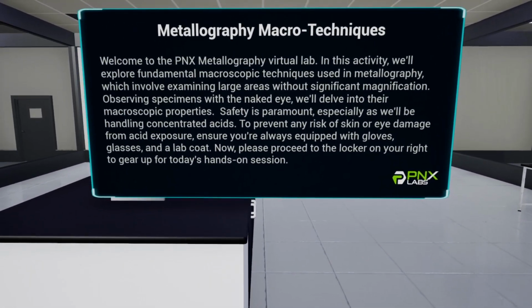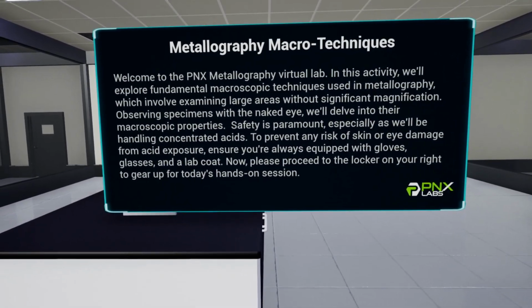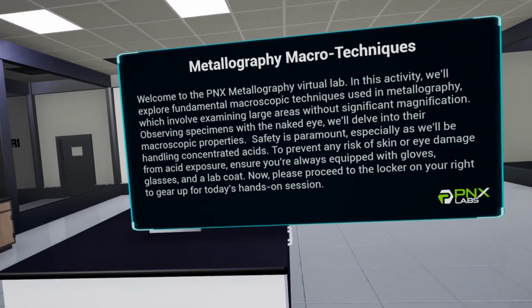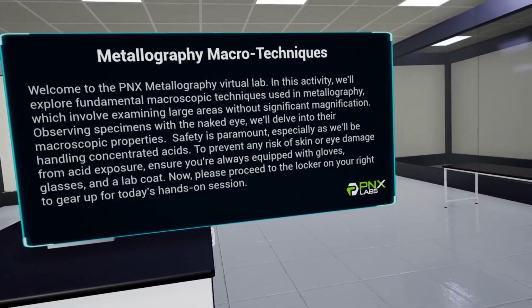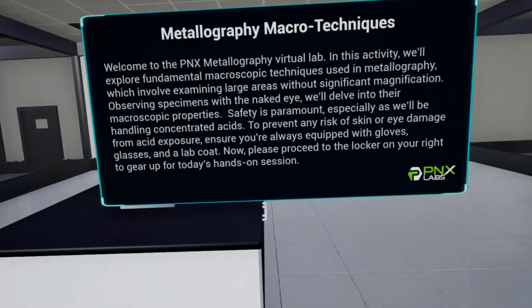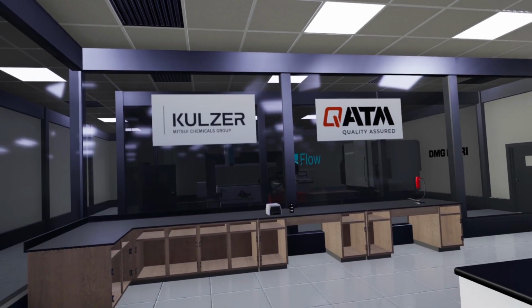Safety is paramount, especially as we'll be handling concentrated acids. To prevent any risk of skin or eye damage from acid exposure, ensure you're always equipped with gloves, glasses, and a lab coat. Now, please proceed to the locker on your right to gear up for today's hands-on session.